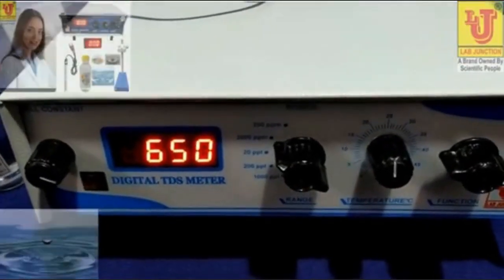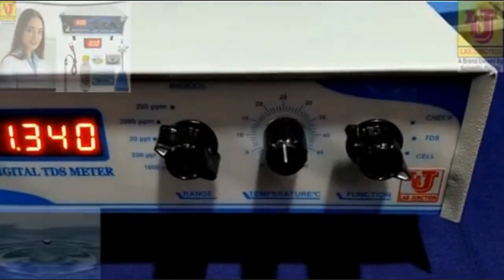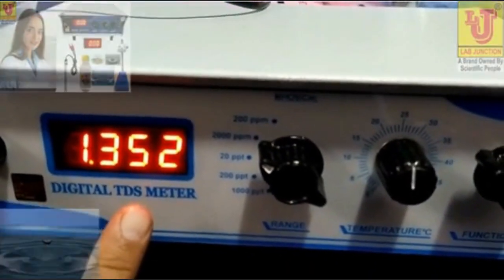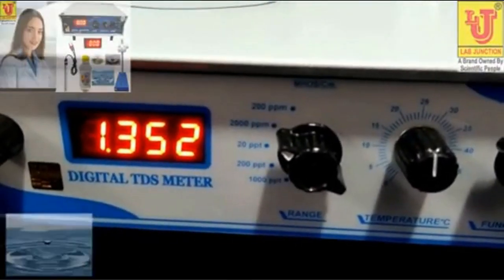Like this. Now go to cell constant knob. Your cell constant is 1.352. You note down in your notebook.